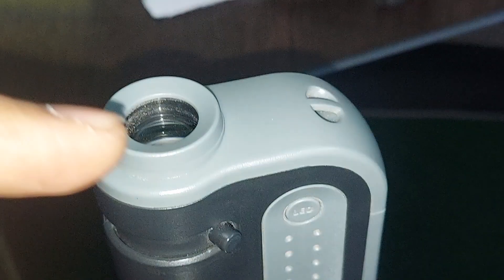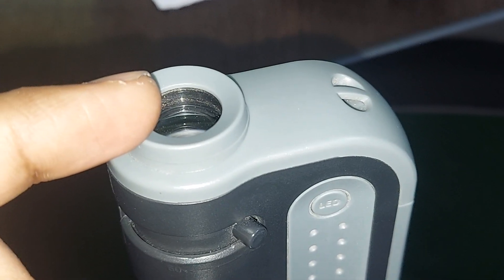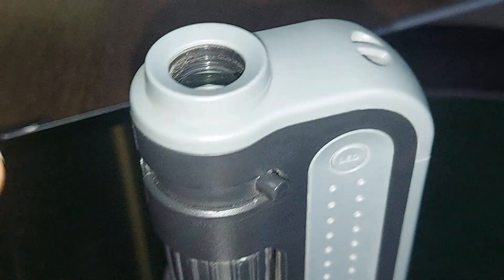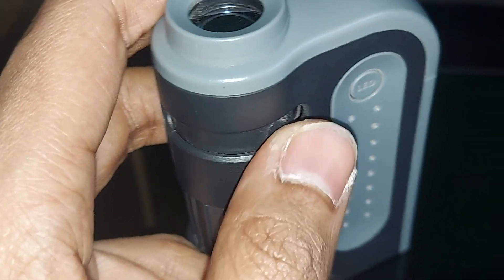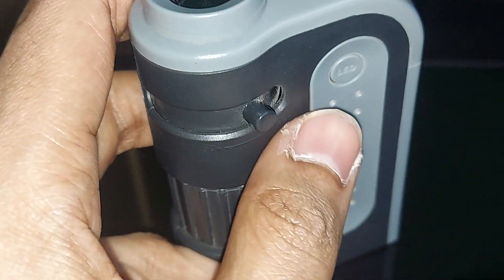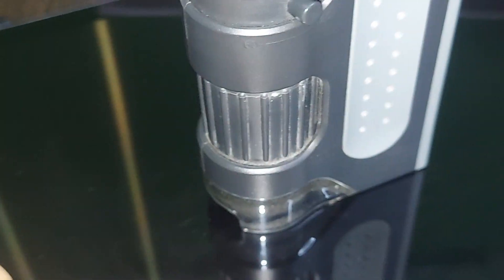The camera setup right now: I have to look through here, I can put my eyes here or my mobile camera here, and I can control the zoom range from here. This one is 60x and this one is 180x. And this is the focusing ring — I can focus it and put the subject here.